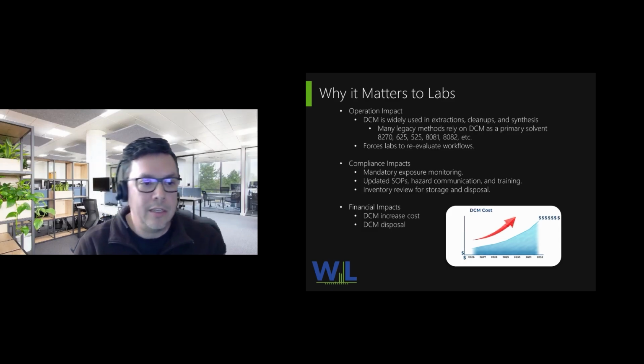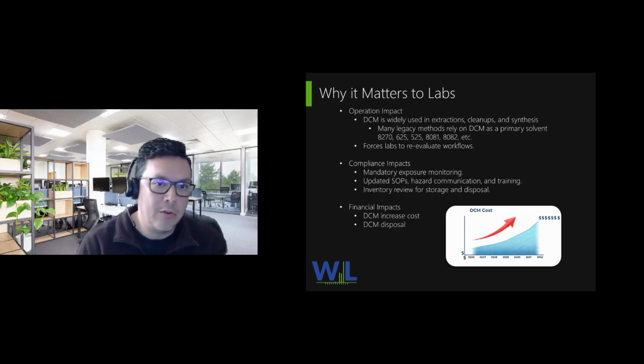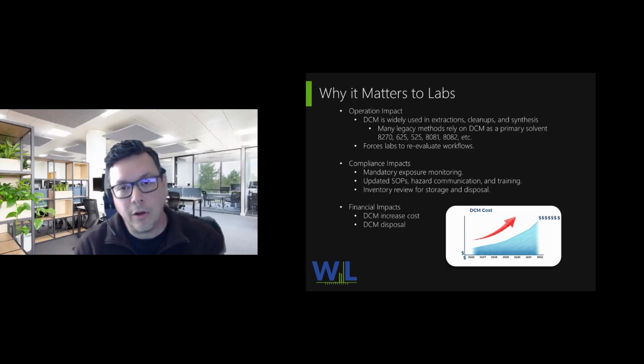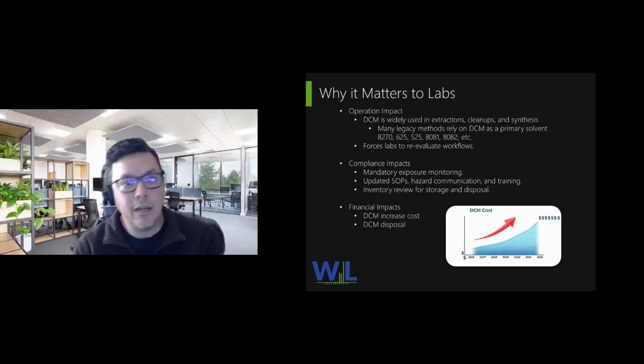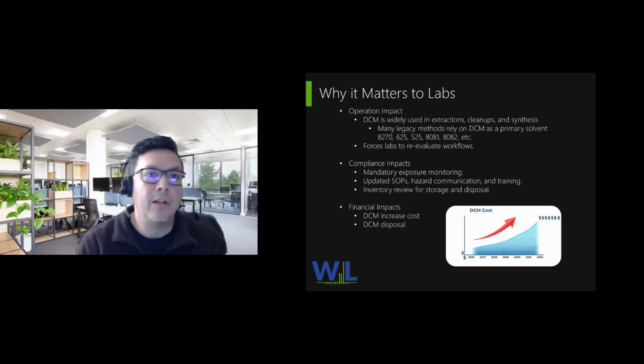The DCM ban increases, it's going to have essentially a shortage. It's going to be produced less. So the lack of production is going to increase the cost, and it's going to go up throughout the years. And I see that already. The cost of DCM is going up. Also, disposal. Getting rid of methylene chloride, we don't use 100% of the methylene chloride. So we have to have somebody come pick it up, treat it, and dispose of it properly. That's also going to increase in cost.